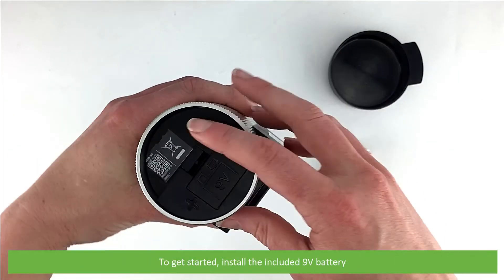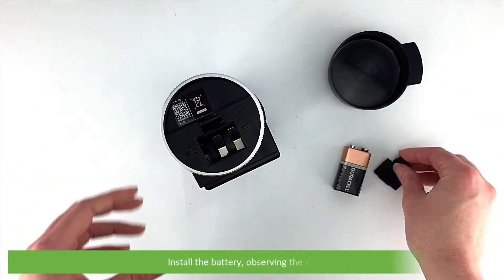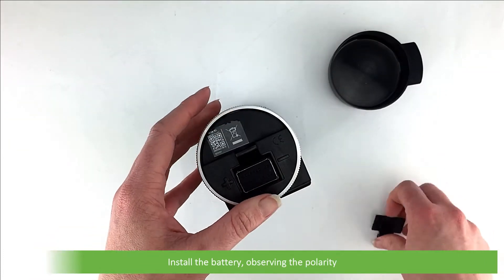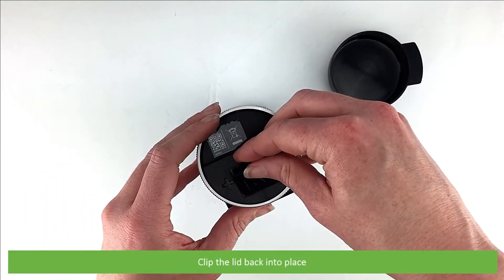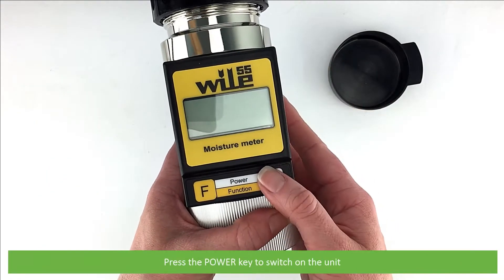To get started, install the included 9-volt battery. Unclip the battery compartment door, install the battery observing polarity, clip the lid back into place, then press the power key to switch on the unit.